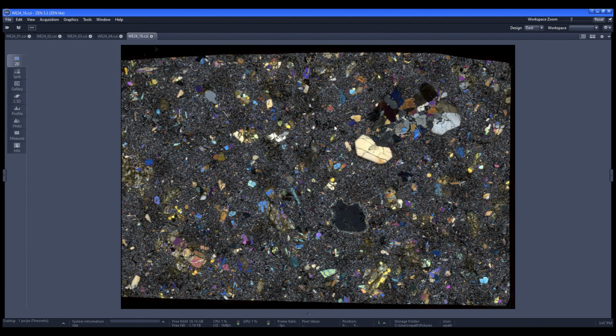All right, so this is going to be the last sample I showed you. So the last three were from Black Butte, but this is from a lava really far away from Black Butte and significantly younger, apparently. Current age dating puts it about 16 million years old, and I can't remember the name of the valley, but it's really close to the Anaconda Range, I believe it is, the mountain range there. There's geologically something known as the Anaconda Metamorphic Core Complex, and it's roughly right up in there.